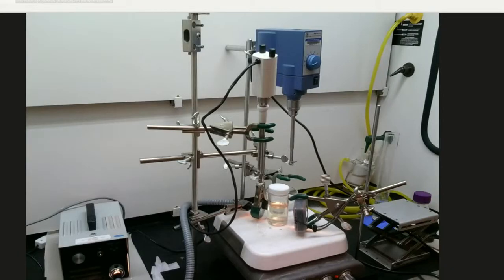The method chosen to measure the API dissolution was to use the birefringence properties of the API particles. The following picture shows the lab setup used to evaluate this technique.